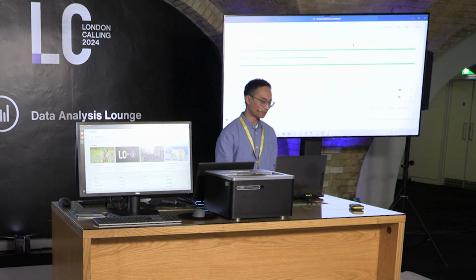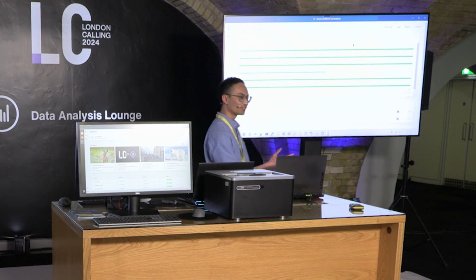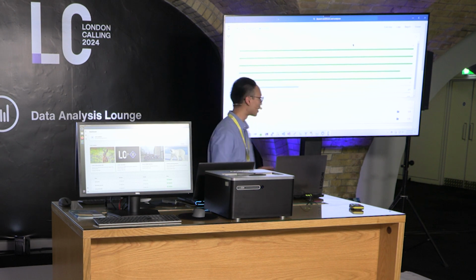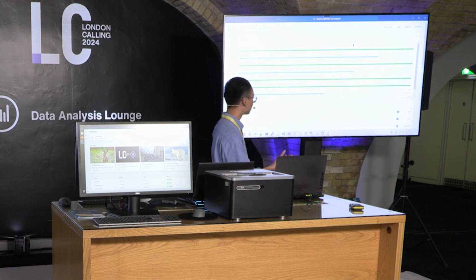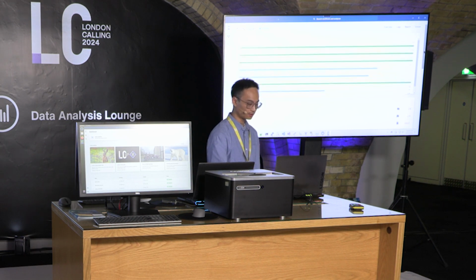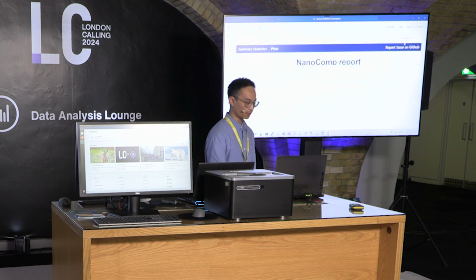Okay, so there we go. We see some activities happening, which indicates that the pipeline is currently processing and producing the results in real time. And so these results are also being actively compiled into interactive reports, which are usually in HTML format. So we can actually scroll down here to see if any HTML file has been generated. And we can see that there is one HTML file already generated. So we can actually head over to our report tab.